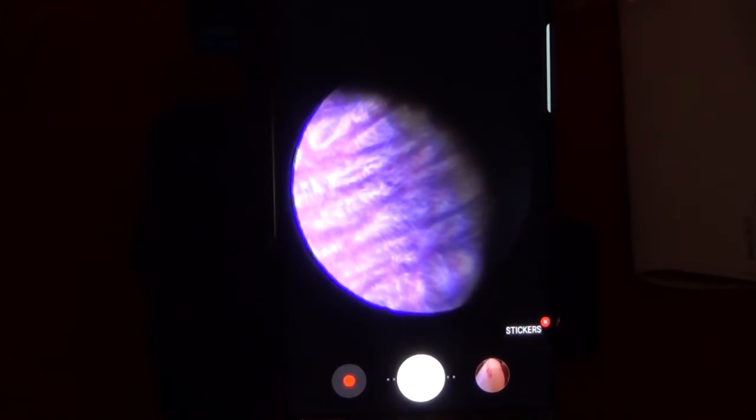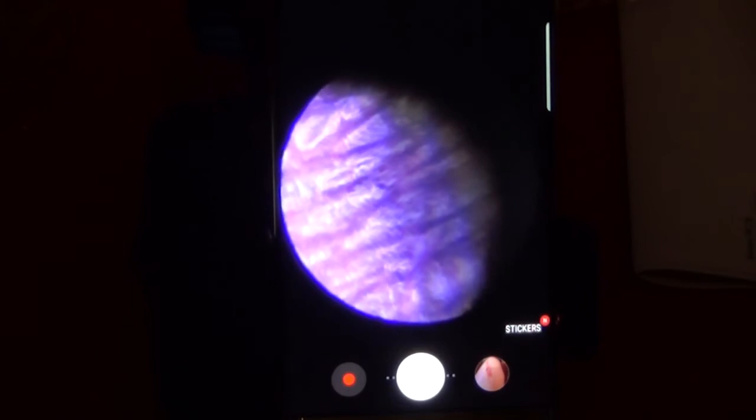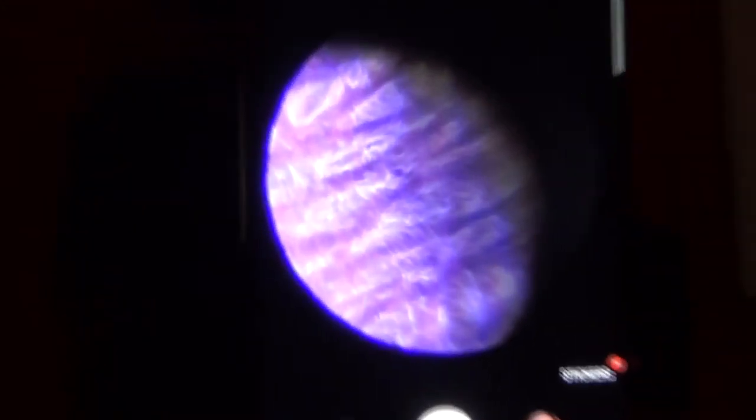Okay, I got the mount on. Please be aware it's very fiddly to get the actual phone in the right position, especially if you have one of those fancy cameras with the three-camera setup on the end of your phone. Now this is a Samsung Galaxy S7 Edge — it's only got one camera on the back. I managed to get it in position and I'm not going to touch it because if I do it will mess it around.